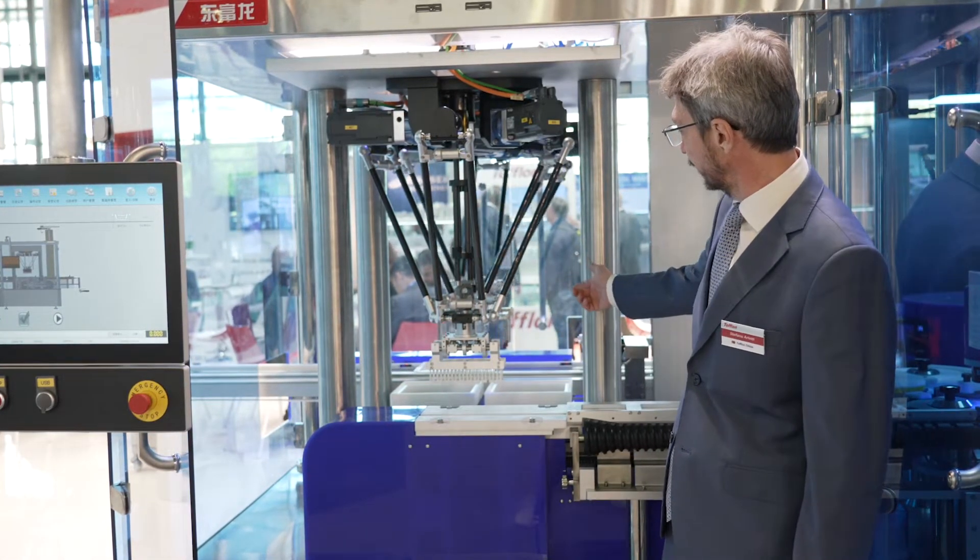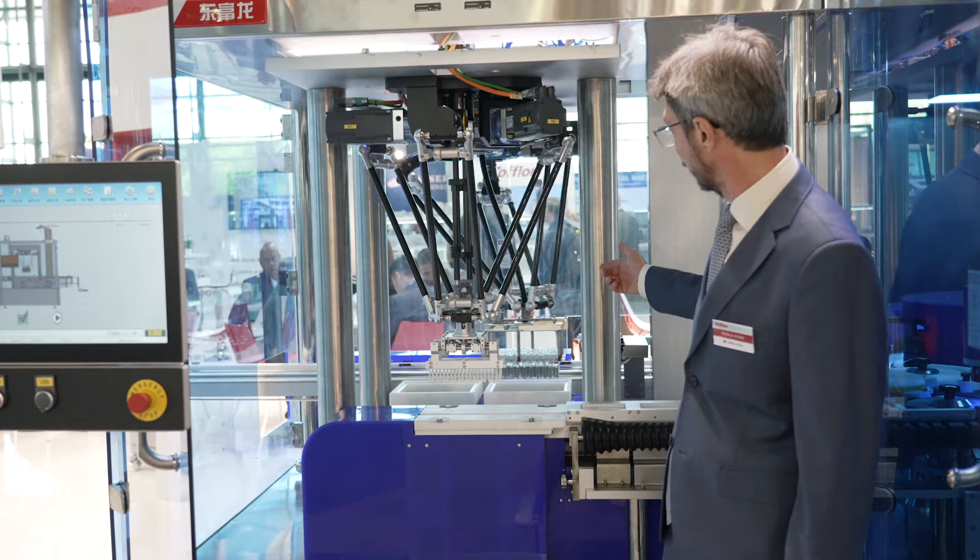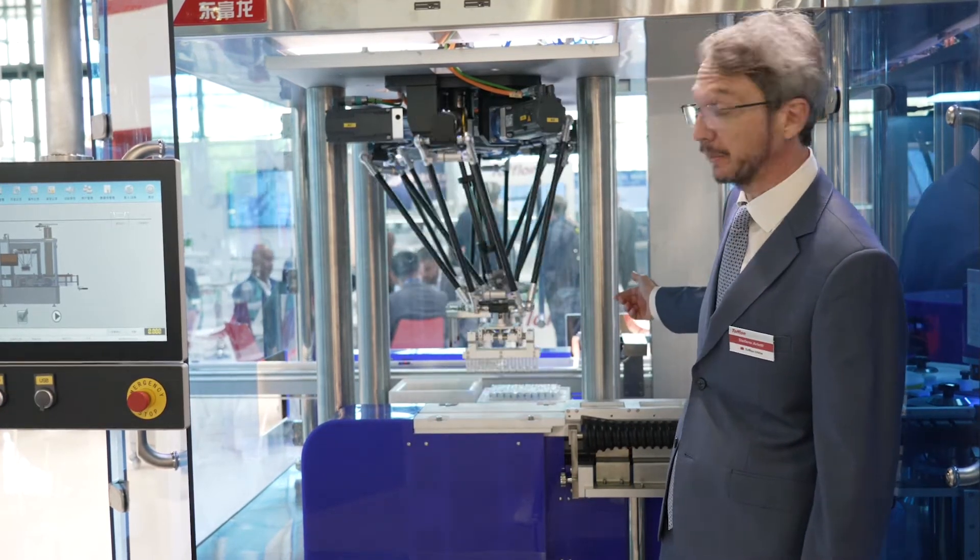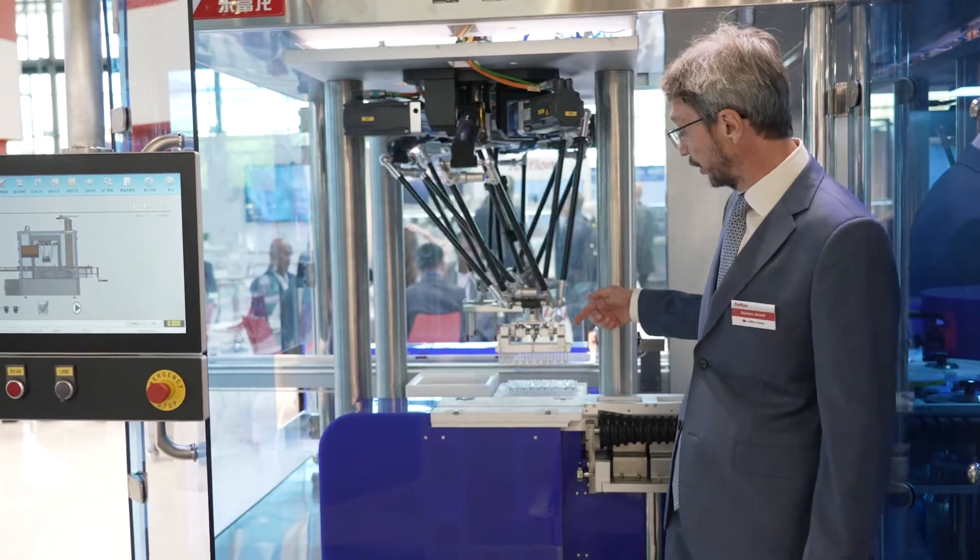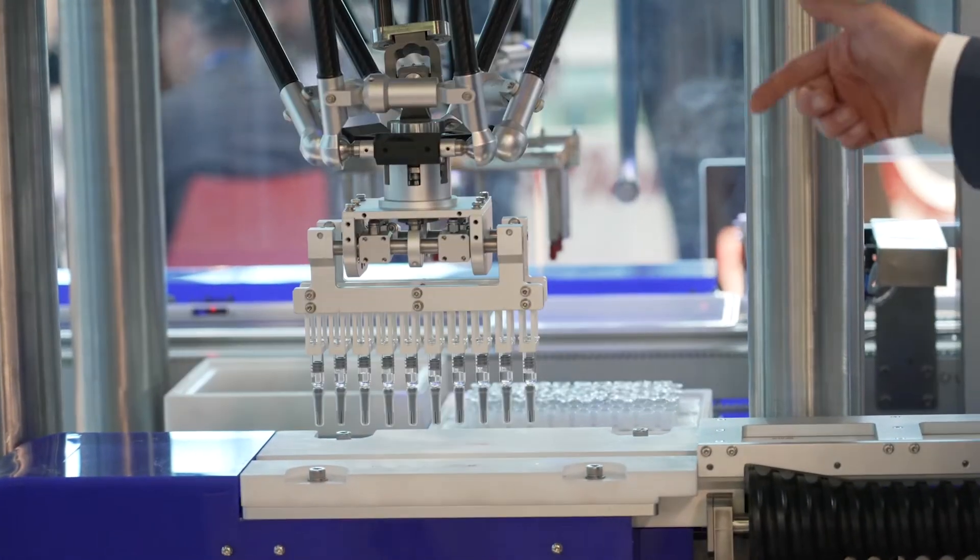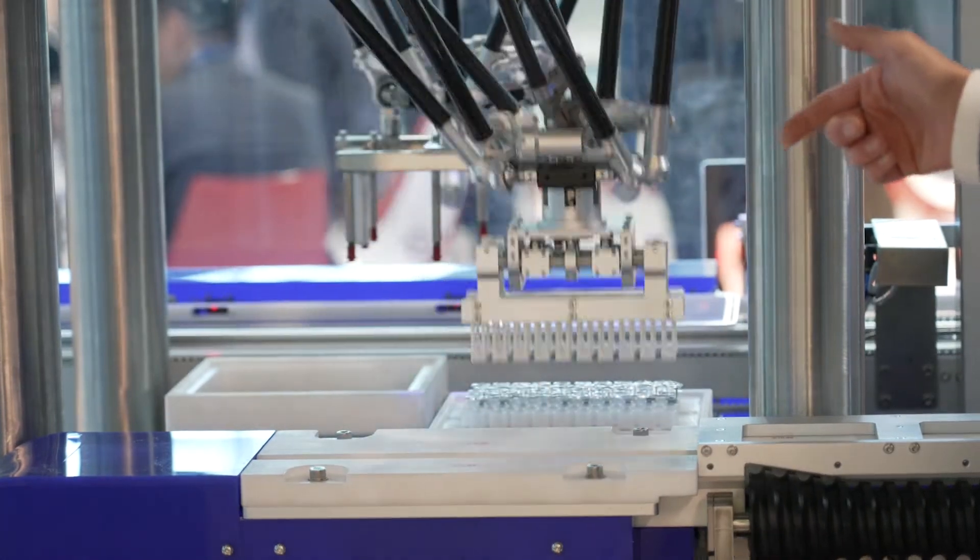This is the denesting area. I will show you more in detail. The full nest is coming in. Then the first robot puts the nest in the denesting area. Then the second robot will pick up the syringes row by row and load in the infeed area of the inspection machine.